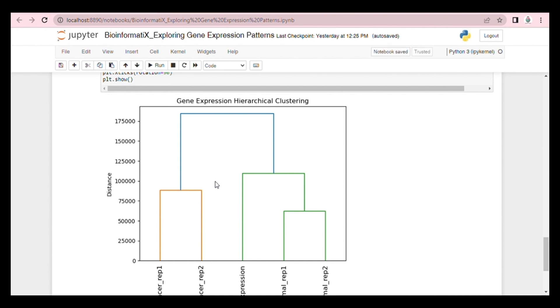The lines in the dendrogram represent the merging of clusters. When two samples or clusters are merged, a line is drawn connecting them at a specific distance. The height at which the line is drawn represents the dissimilarity at which the clusters were merged. By looking at the lines, you can observe how samples or clusters are grouped together based on their similarity. The clustering analysis can reveal groups or subgroups within the samples and provide insights into the underlying structure in gene expression profiles. Now let's perform the principal component analysis, PCA.